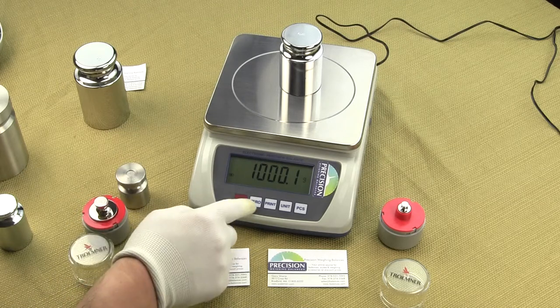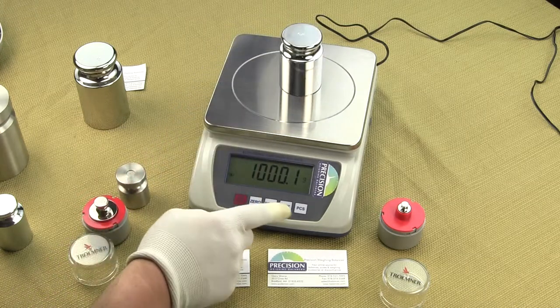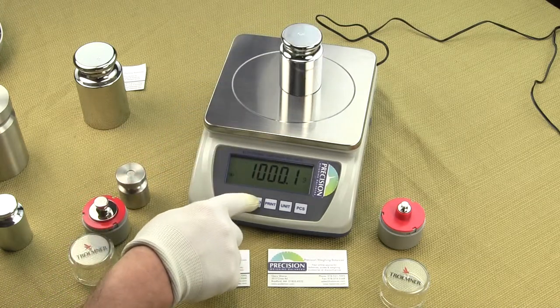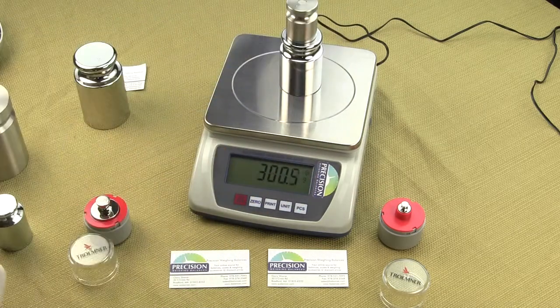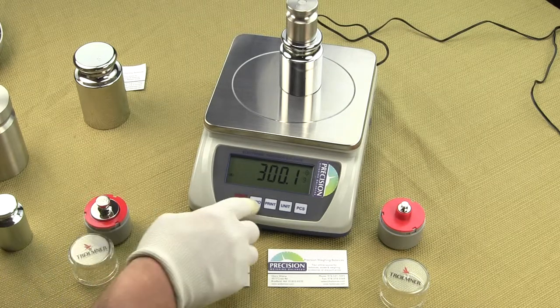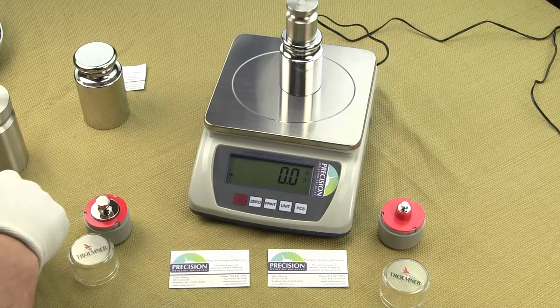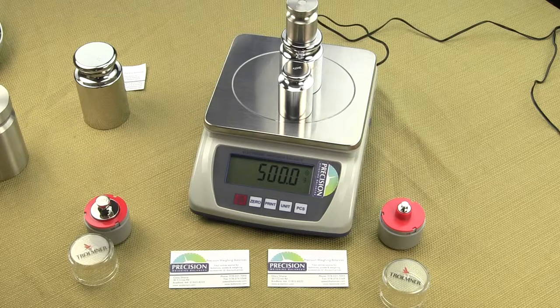You can use the tare to zero out a container. We'll zero out a one kilogram weight, place another weight on the scale — and there you go, that's the tare function. You can tare to capacity, tare that weight out, and use another weight. You can see how fast the scale responds.